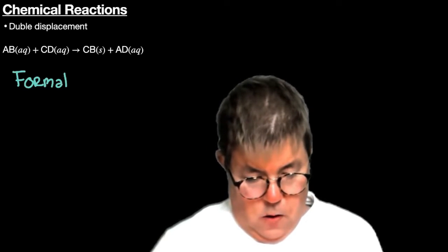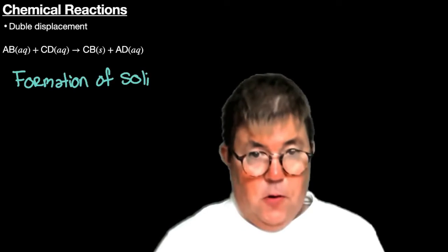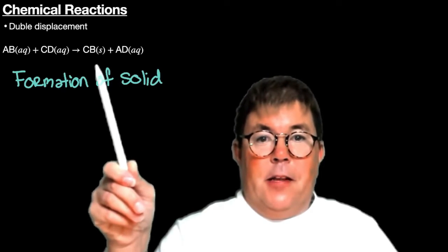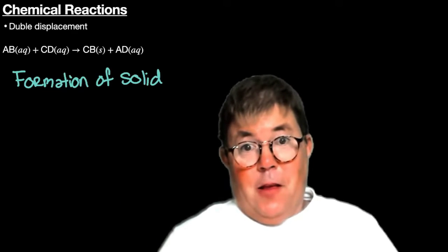So what we are really looking for here is the formation of a solid, which is indicative that we had this double displacement reaction.